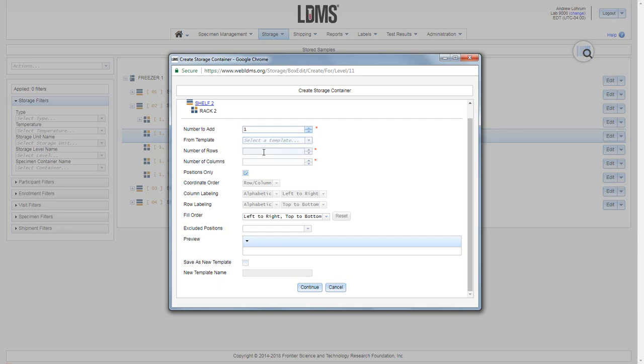A template will pre-fill the remaining menu and build the box for you. It is not necessary to use, but it can save you time if you are always utilizing the same type of storage container.